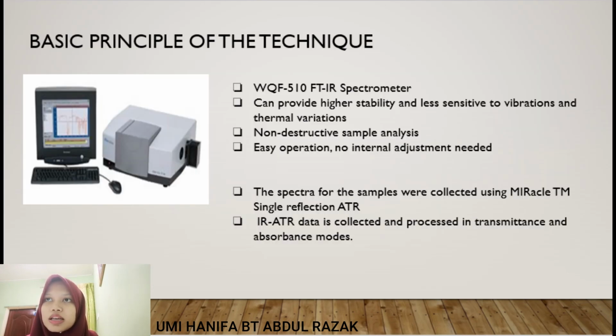Basic principle of the technique: the WQF-510 FTIR spectrometer can provide higher stability and is less sensitive to vibrations and thermal variations. The spectra for the samples were collected using the MIRacle Single Reflection ATR. IR data is collected and processed in transmittance and absorbance modes.